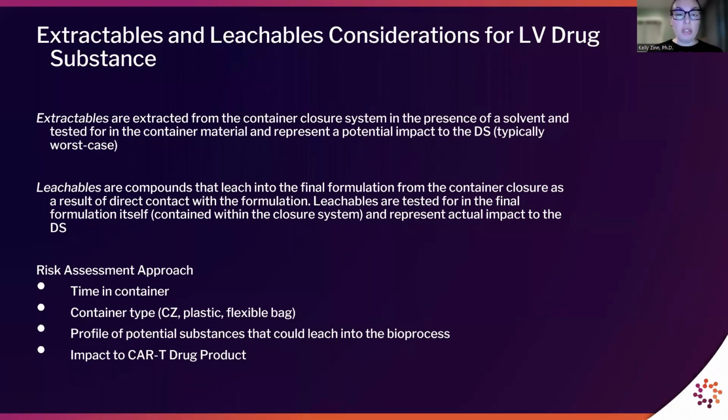Extractables represent a potential impact to the drug substance, and are typically considered the worst case. Whereas leachables are compounds that leach into the final formulation from the container as a result of direct contact between the container and the formulation. Leachables are tested for in the final formulation itself, and represent an actual impact to the drug substance.